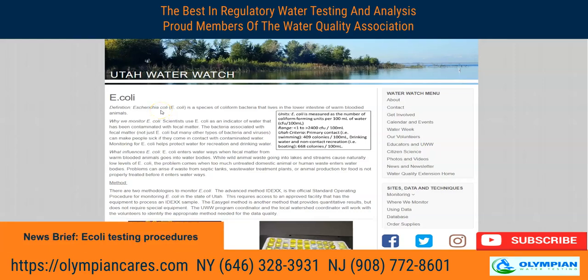Here's everything you need to know about E. coli from Utah Water Watch. So why do we monitor E. coli? Well, scientists use E. coli as an indicator of water that has been contaminated with fecal matter.